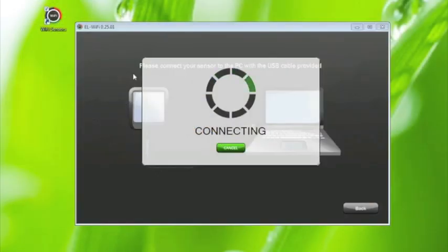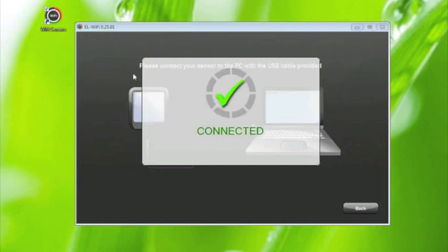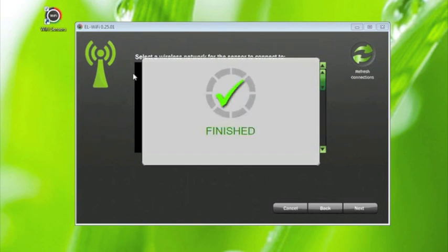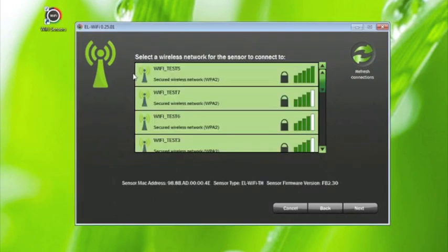The software will immediately start searching for this connection to be verified. You will soon see the connected message. The sensor will then immediately start to scan for available Wi-Fi networks within range. This may take several seconds.